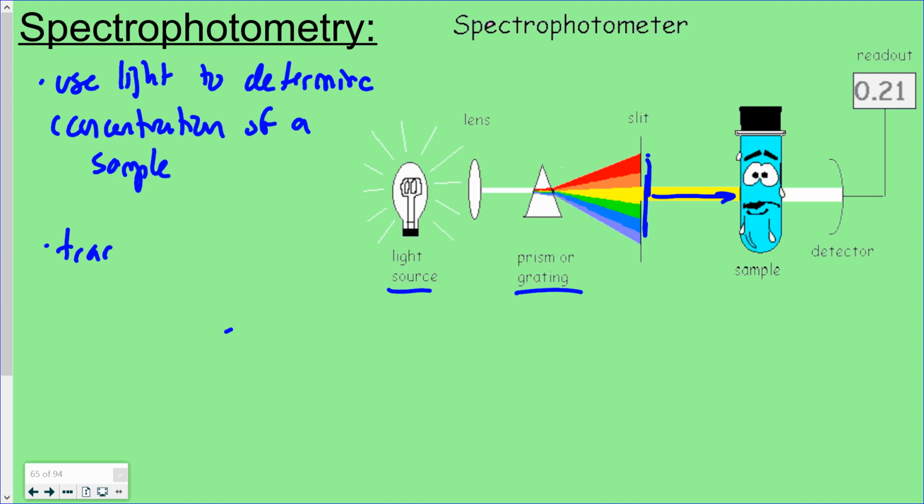The first is the transmittance of the sample. The transmittance is just a ratio of how much light gets through the sample. The more light that gets through, the higher the transmittance. A completely blank sample should let 100% of the light get through, and so the transmittance would be 100% for a blank sample, similar to what we used in our lab.